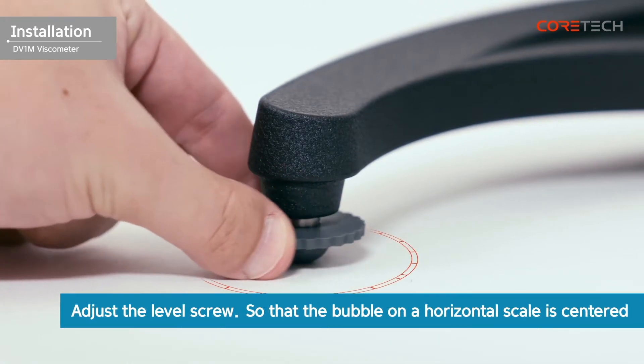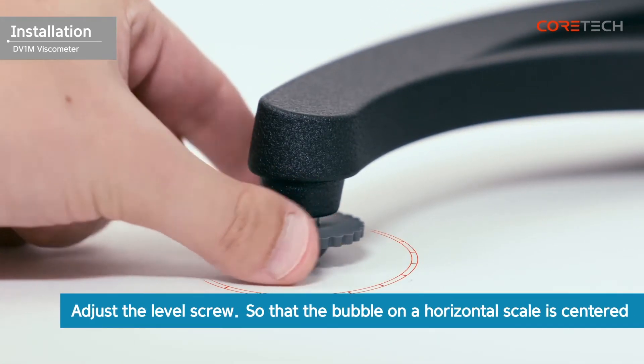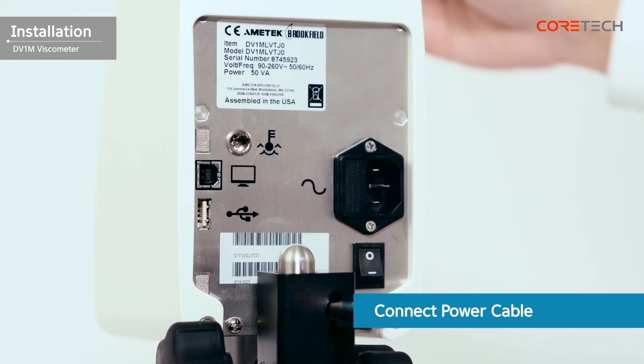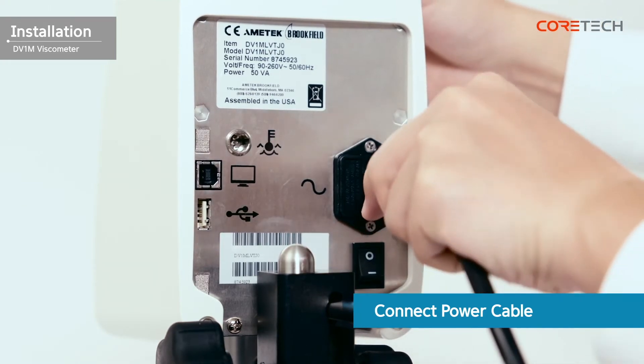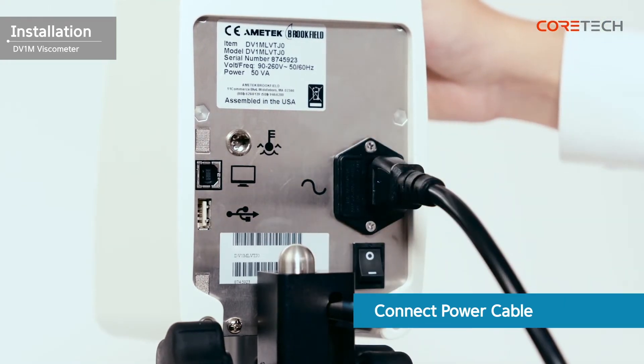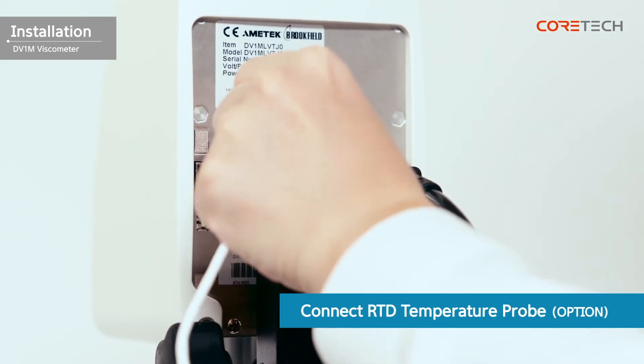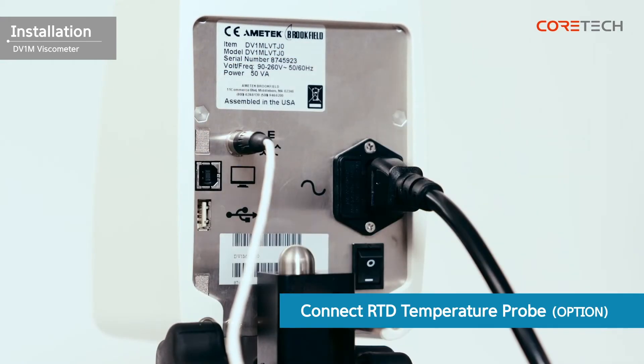Rotate the level screw at the bottom of the stand so that the bubble on the horizontal meter is centered. The installation of the viscometer is complete when the power cable is connected to the power port on the back of the body. If you purchased the RTD temperature probe separately, connect it to the connection port.